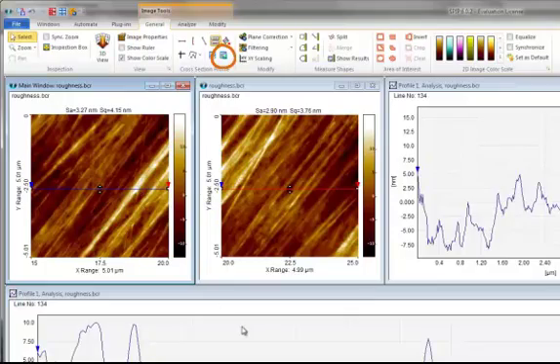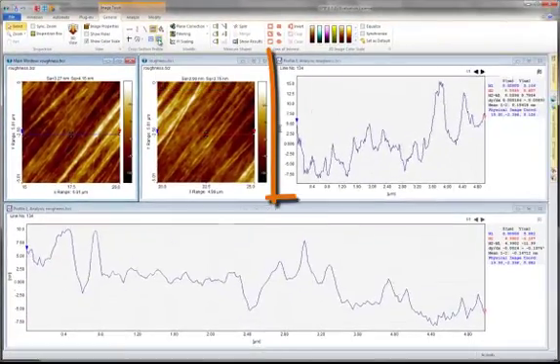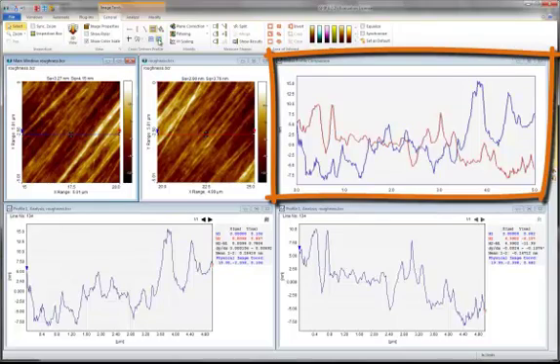Now enable the Global Profile Comparison window which allows you to compare cross sections from several images.